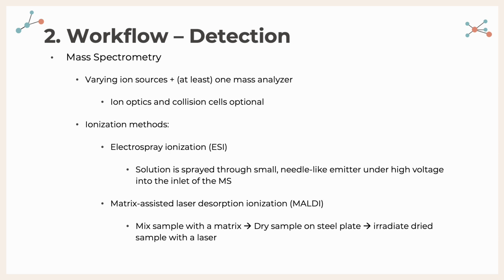You have various ionization methods. There are many out there, but these are the two most common for proteomics. Electrospray ionization, where you're spraying the solution through a small needle-like emitter under high voltage to give that sample a charge, which then creates the ions. Or you have MALDI, or matrix-assisted laser desorption ionization. The mechanism is there at the bottom, where you mix the sample with a certain matrix, you dry it on a steel plate, and then you irradiate the dried sample with a laser.